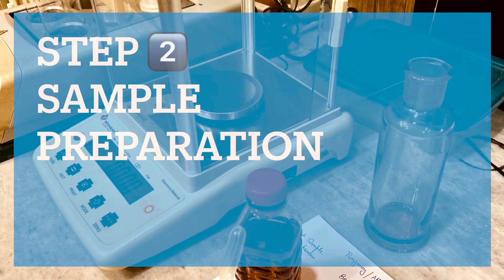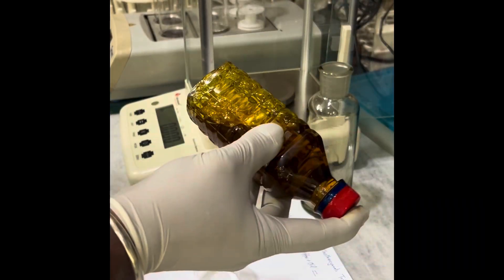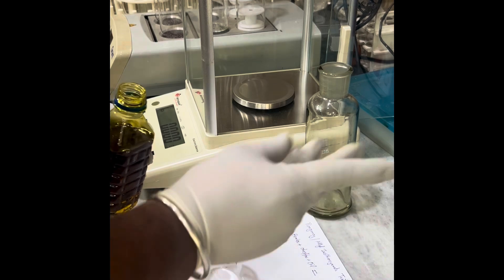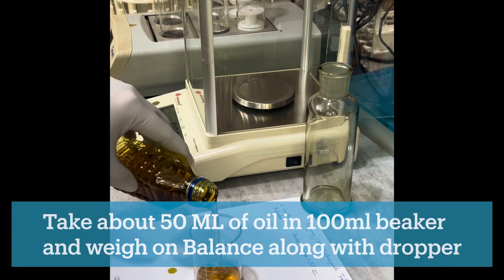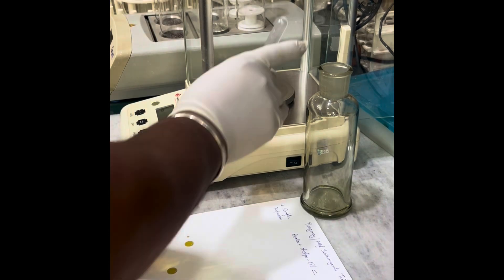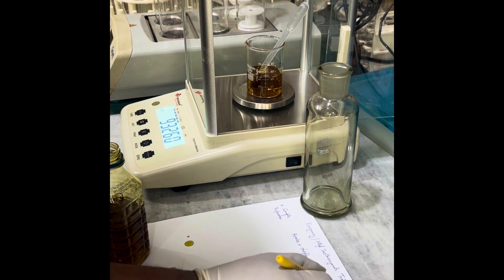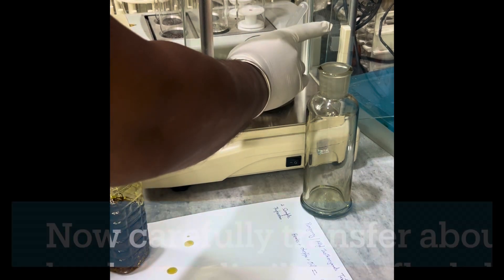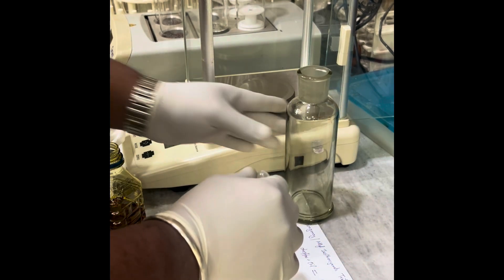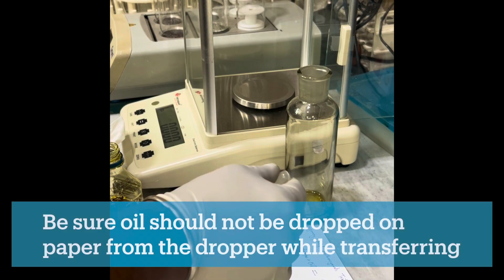In the second step, sample preparation, we will weigh accurately about 5 grams of the oil. If direct weighing in the distillation flask is not possible, use the indirect method: mix the sample thoroughly and take about 50 ml of oil in a 100 ml beaker. Take the weight of oil plus beaker plus dropper on the balance and note this as the initial reading. Then carefully transfer about 5 grams of oil from the beaker to the distillation flask using the dropper, ensuring no oil drops out during transfer.